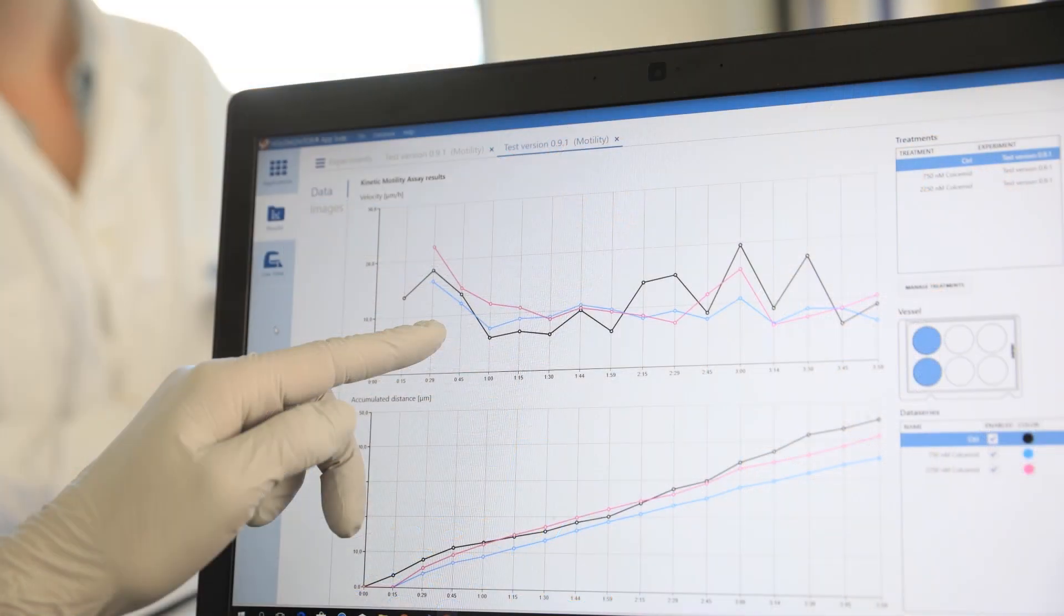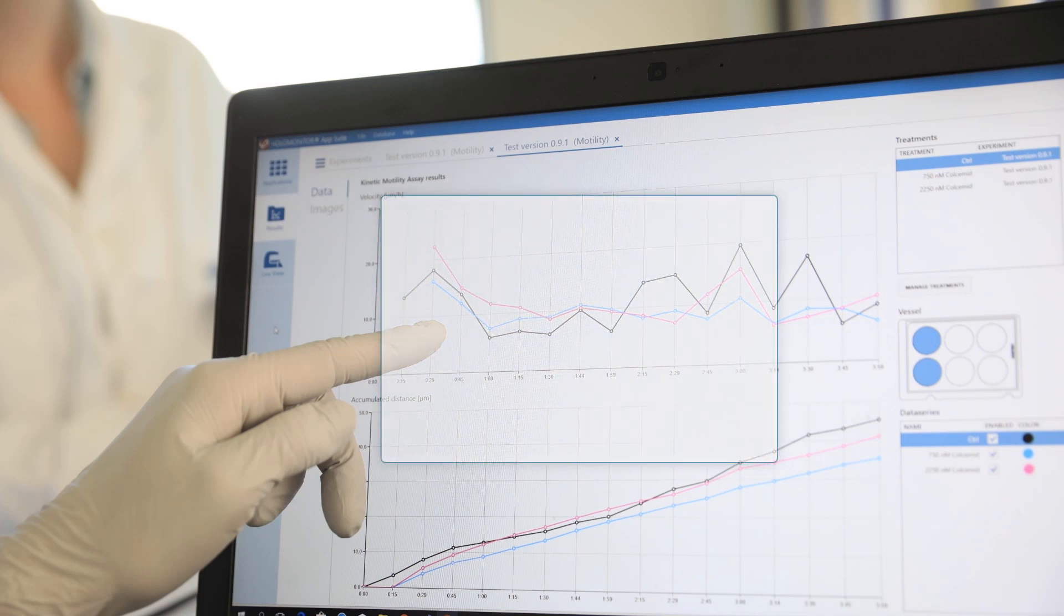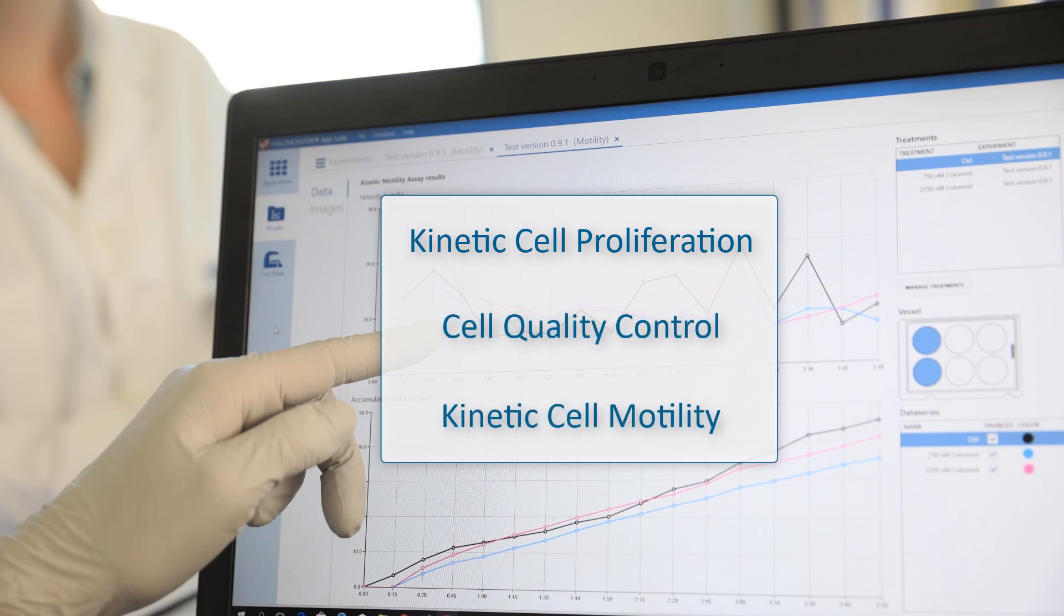The user-friendly software AppSuite now offers the following assays: kinetic cell proliferation, cell quality control, and kinetic cell motility. We are currently developing further assays.